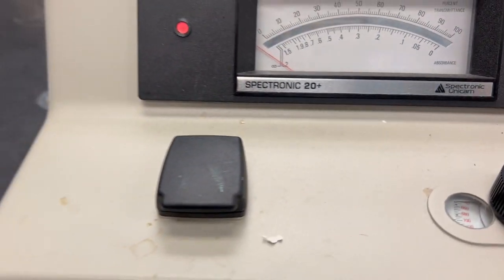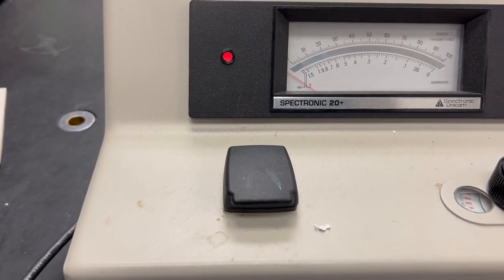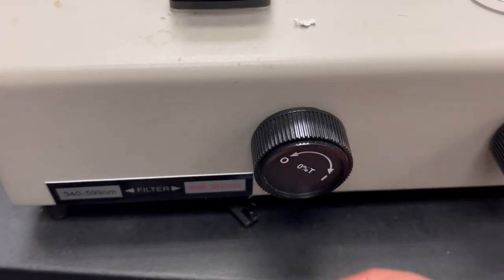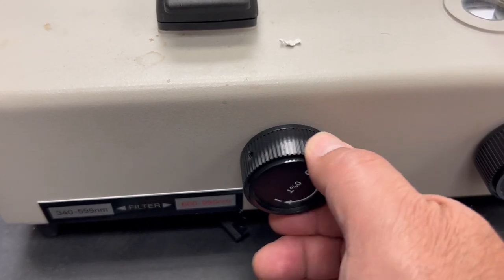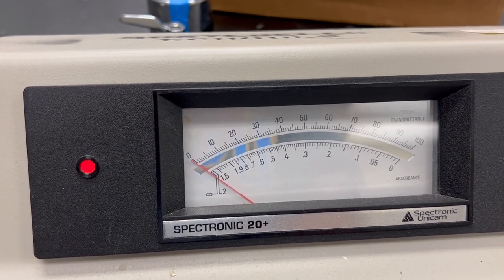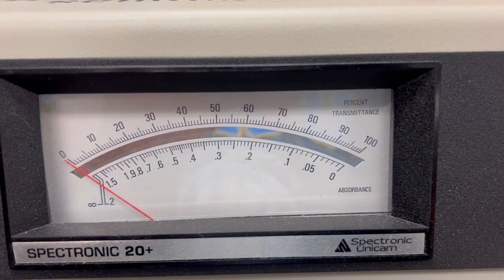When the machine is empty and closed, the shutter is closed, so it should read zero. If it does not read zero, you go to the zero button and dial it until it reads zero on the percent transmittance.